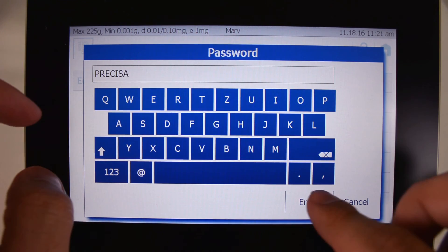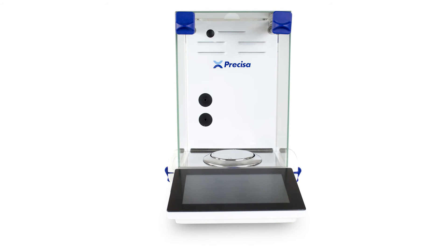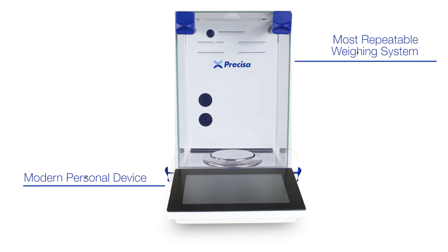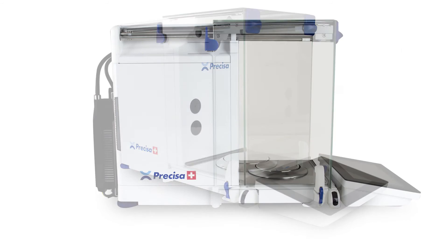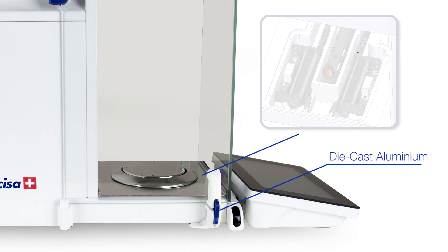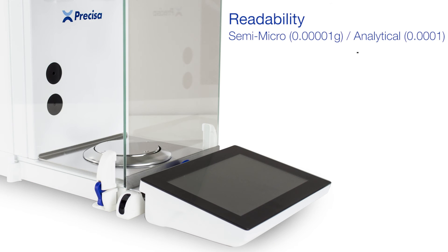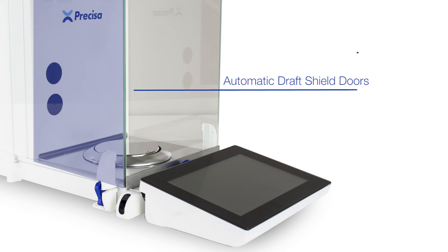The H series balance is a marriage between modern personal device technology and the most sensitive and repeatable weighing system we have ever produced, all surrounded by a tough die-cast aluminum frame protecting the ultra-sensitive internal sensor. The balance is capable of analytical and semi-micro readability.